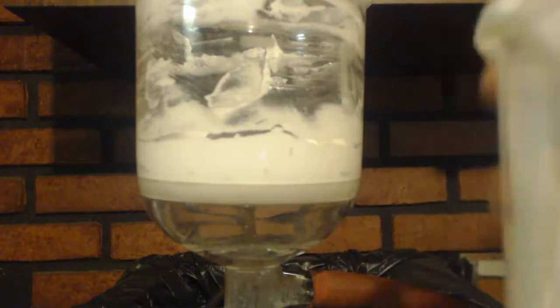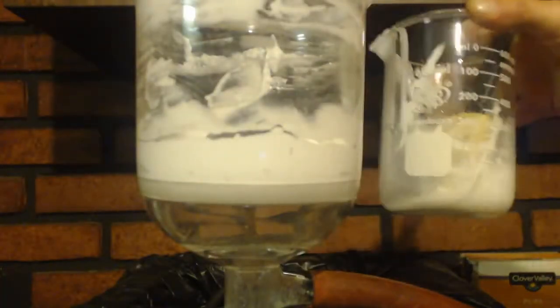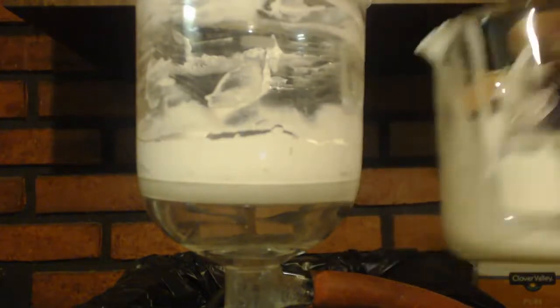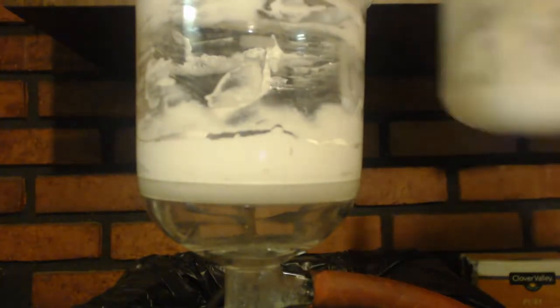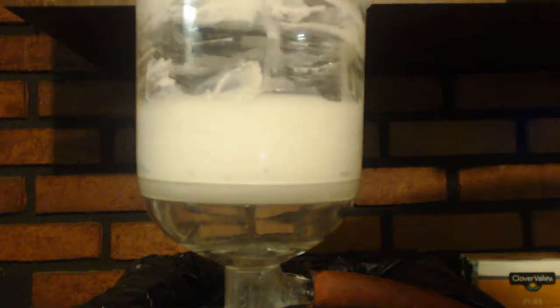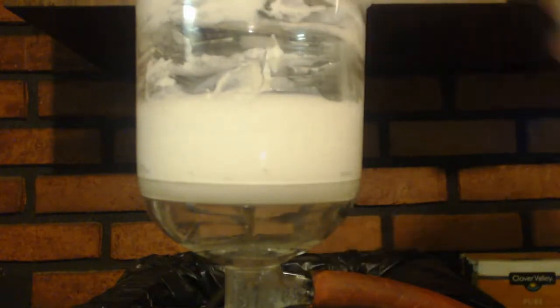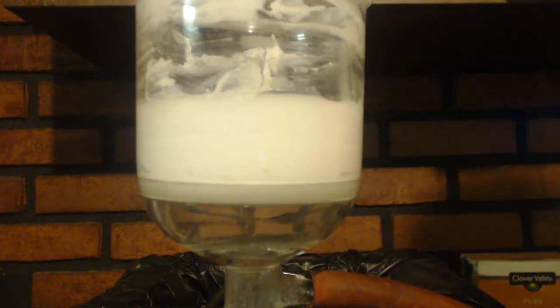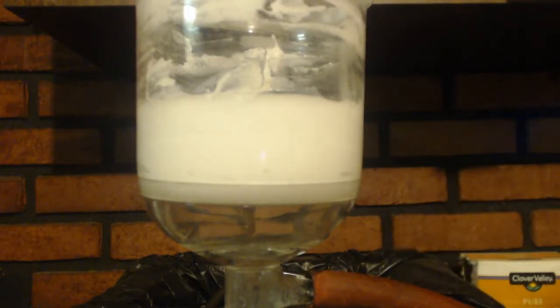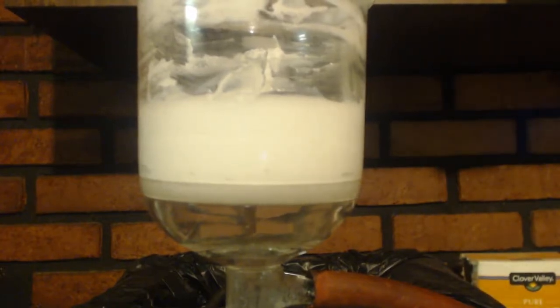Alright, so I put some more water in the beaker I was using and stir it around to clean it up, get some of that out of there. And I'm going to wash this. I'm going to pour it right in here. The solubility between warm and cold for the calcium sulfate is not very different, there's not much difference, so it doesn't matter. But if you use warm, the other stuff will be more soluble, the stuff you want to get out of there, you know what I'm saying? So it's better just to use really warm water.